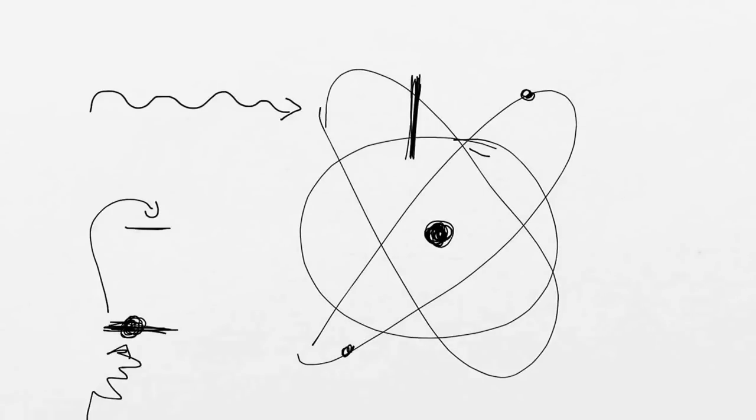but usually electrons don't have that. They can either go up here when the energy is exactly right or not. If the energy is not right, if it is too high or too low, the electron says, sorry, master, no can do. Thank you very much. Yeah? So the energy has to be exactly right.